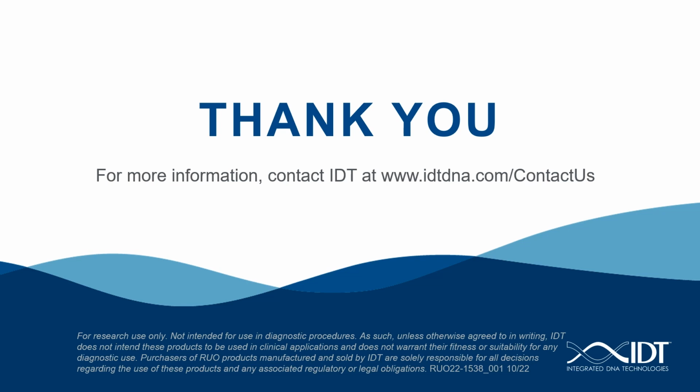Sarah, the first question is, can the direct amplification enhancer be used with purified RNA samples? We do not recommend the direct amplification enhancer to be used for purified RNA samples. And that's because we see a small drop in the sensitivity at very low copy numbers for more difficult primer and probe assays.